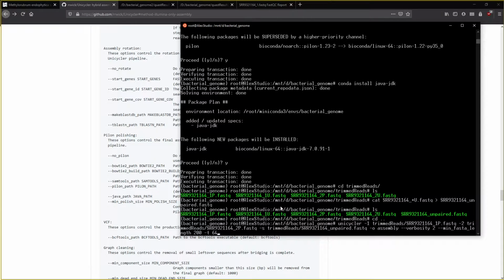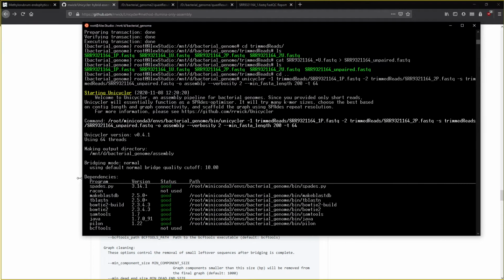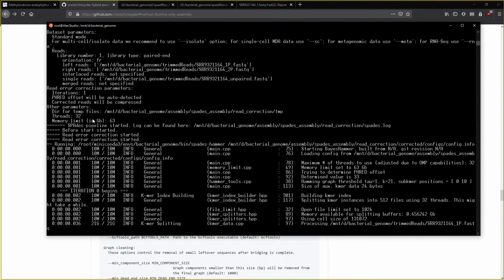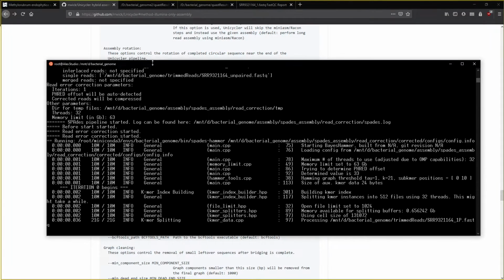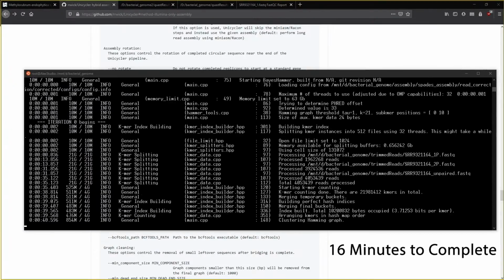So we should be able to just let this go. Let's see if it starts out. See if it gives us an error. There we go, it actually started. So I'm gonna let this run, and I'll fast forward through it so you guys don't have to sit and wait.